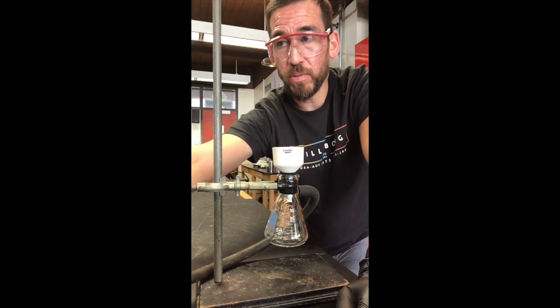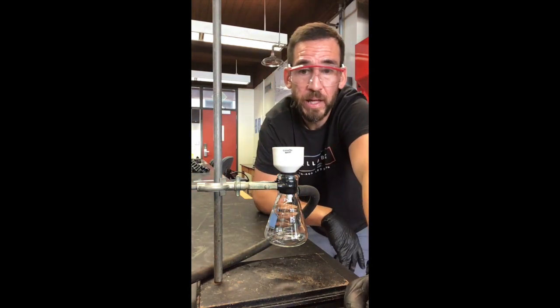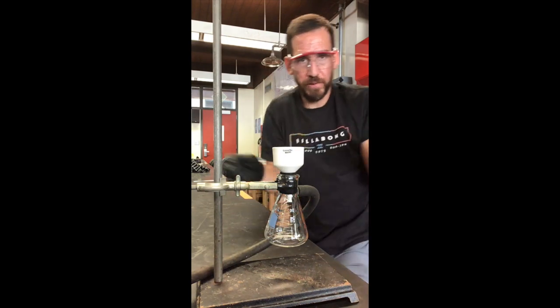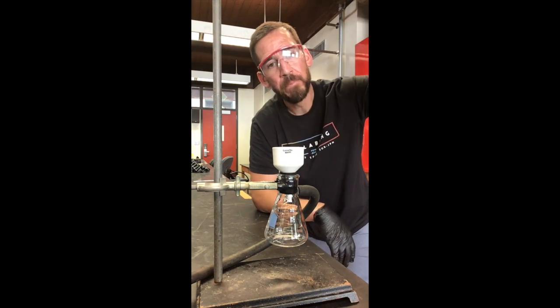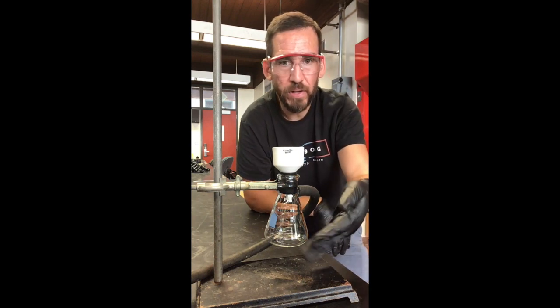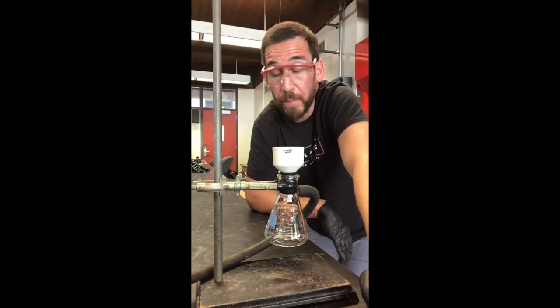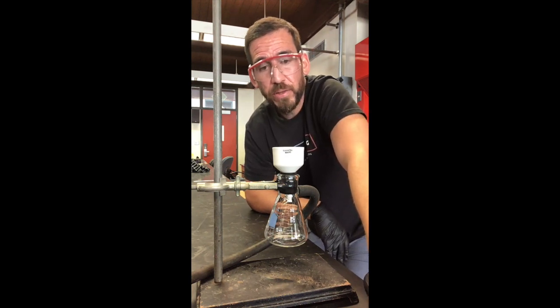Okay, first thing you want to do before you add your material to it is wet the filter paper with a little bit of the solvent that you used, so that it sucks down, because right now the filter paper is kind of ripply, and it's possible that when you pour, some of the solution can sneak underneath, and then solid can fall down into the vacuum flask, and we'll lose material that'll decrease our yield, and we'll be super bummed because we didn't get 100%, which we're probably not going to get anyway. But either way, we want to maximize our yield, right? And that's one of the ways that we can do that.